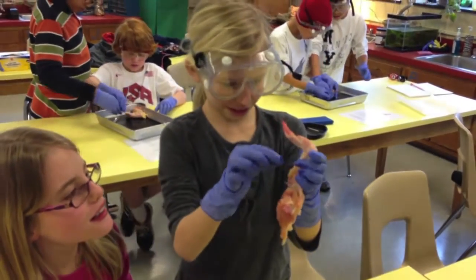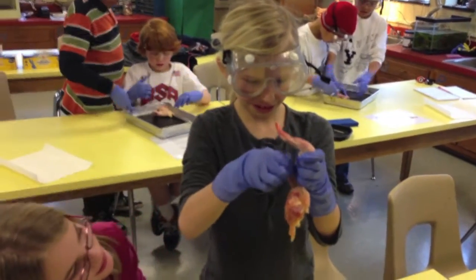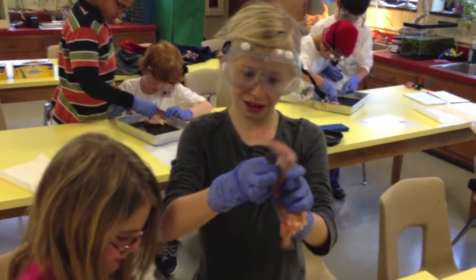What is this? This is a tendon. It looks kind of silver and like a string, and it helps the chicken wing wave.